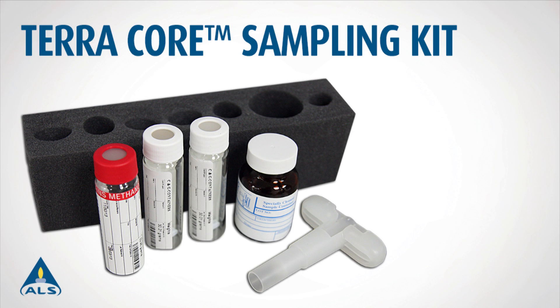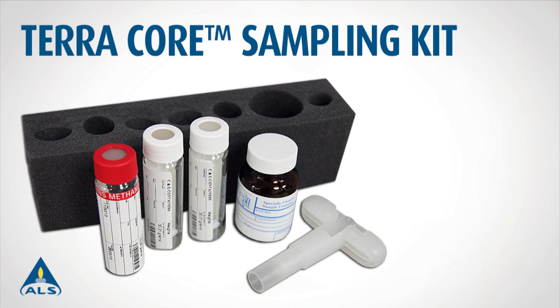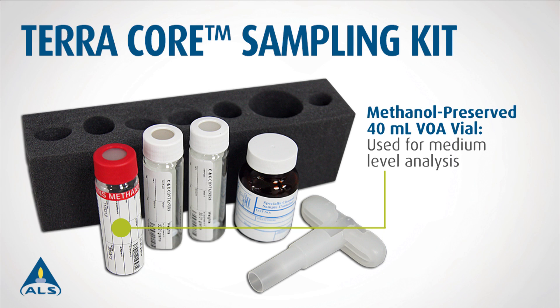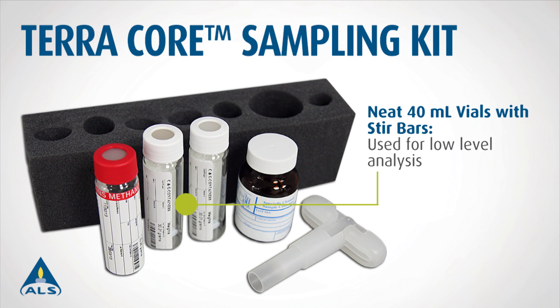Each TerraCore sampling kit is a foam container that includes the following: one TerraCore sampler that collects a 5 gram aliquot, one methanol preserved 40 milliliter VOA vial for medium level analysis, and two neat 40 milliliter vials containing stir bars for low level analysis.